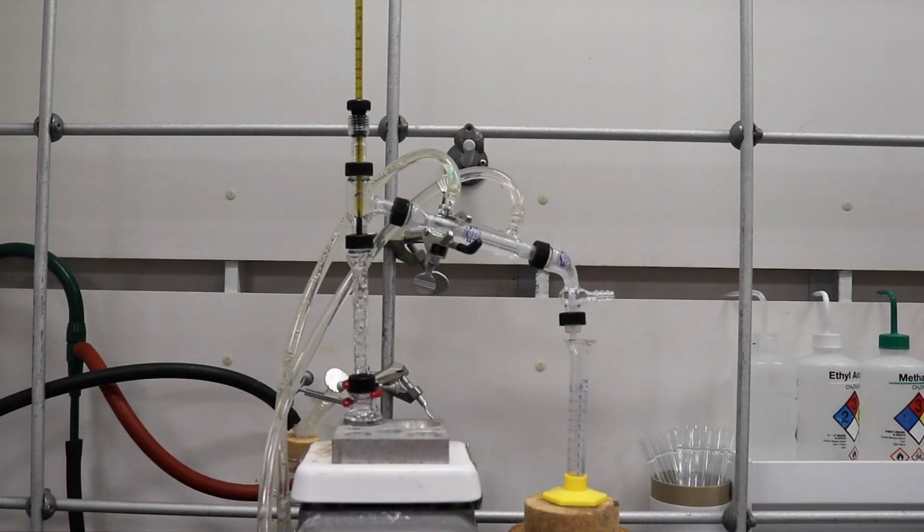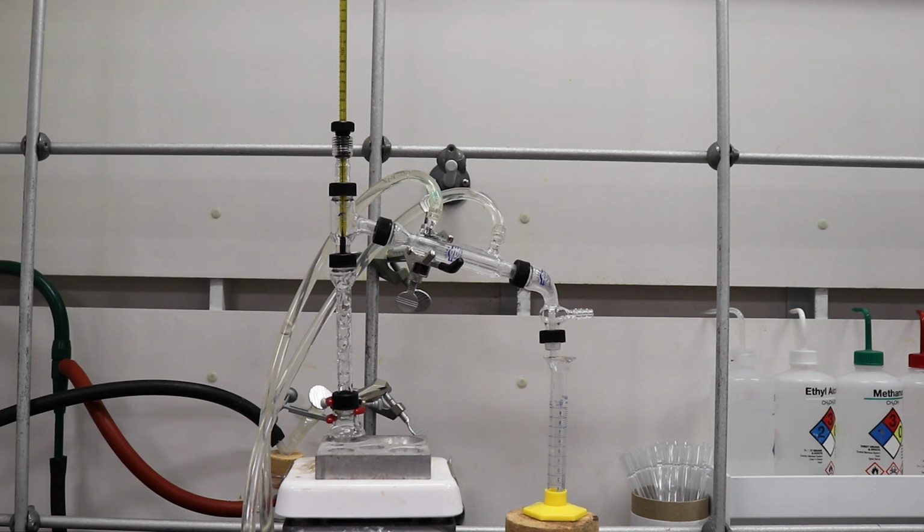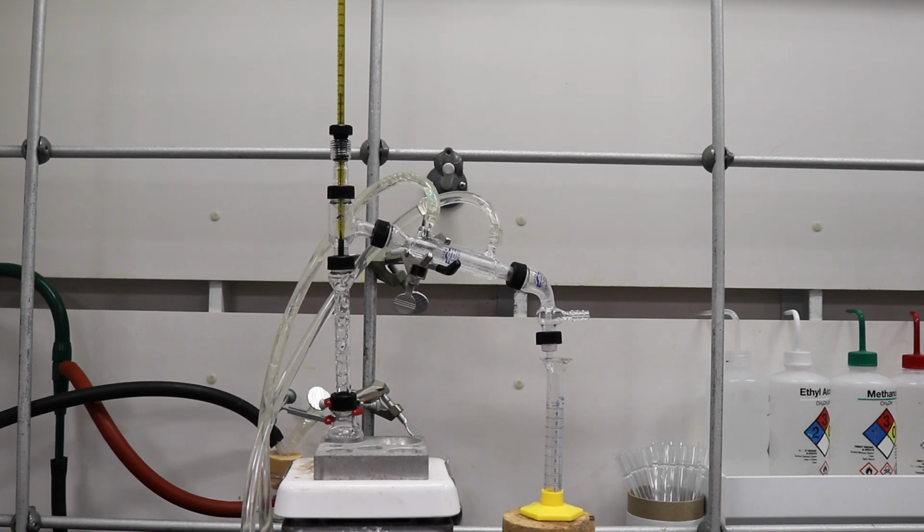And the first compound will come over, and then the second compound will distill over, because remember, mixture A is a mixture of two compounds. And what we're going to do is record the temperature at the first drop, and then record the temperature at every half mL. Again, we're going to record till we get about 7.5 mL, because we do not want to distill to dryness.